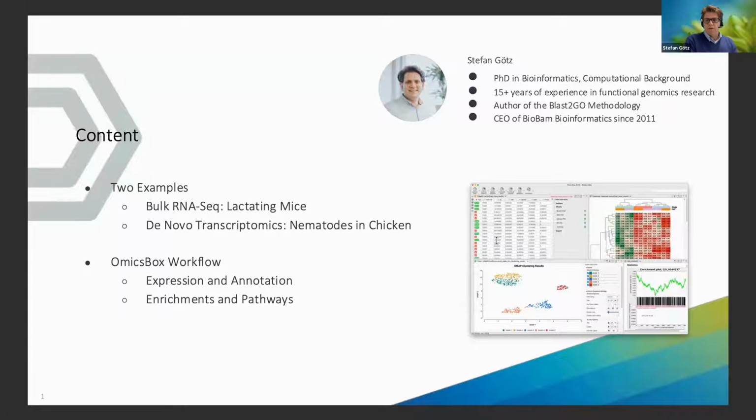By using those, we will not really go too much into the biology, but we will explain all those features and functions in OmicsBox, which are useful to analyze those types or other types of data sets. Okay. And I want to keep it practical today. So I have some slides, and then I really want to open up OmicsBox and show you around all those features and functions, which hopefully might be useful for some of your studies.